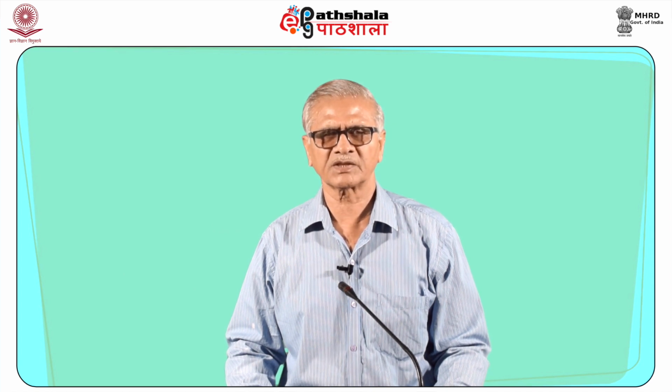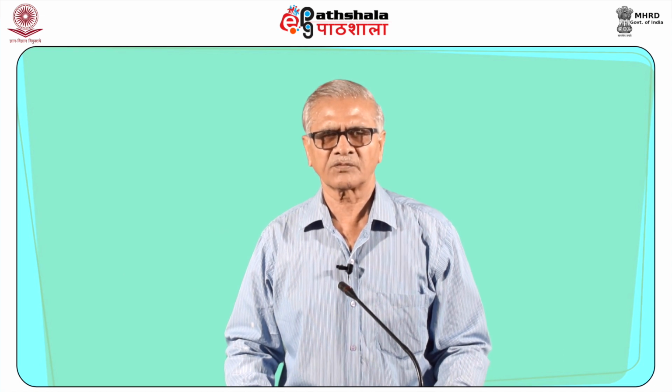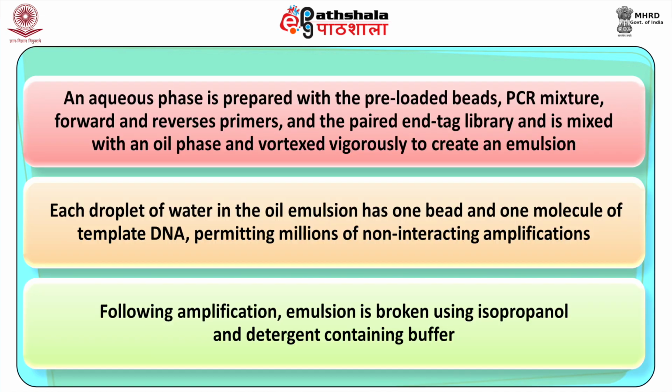Because of strong affinity between biotin and streptavidin, the forward primer will bind to the bead surface tightly. Following this, an aqueous phase is prepared with preloaded beads, PCR mixture, forward and reverse primer and the paired end tag library, and is mixed with an oil phase and vortexed vigorously to create an emulsion.